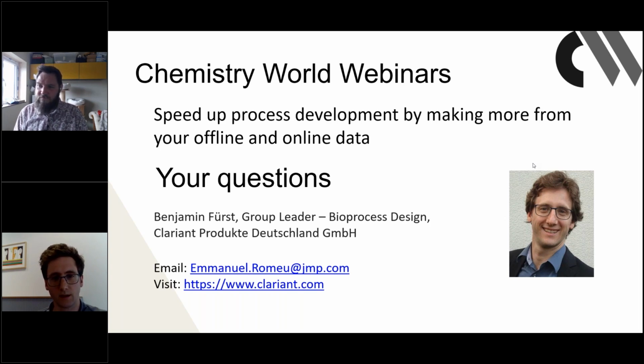Yeah, sure. Basically, you can use it on every kind of curved data. Whatever you have as a response on your axis, whatever dimension you have, for instance viscosity measured over a shear rate. That's functional data. Or you can think of spectrometry, where you have your spectrum over the wavelength. You can model that. Anything which has a shape, everything which is a shape you can put in there. Kinetics, you name it.